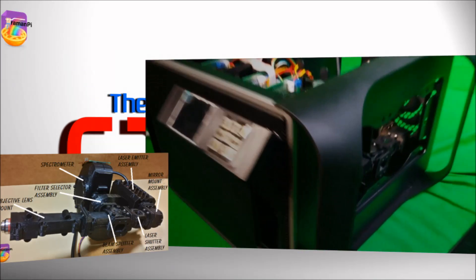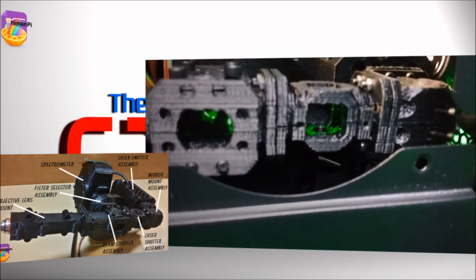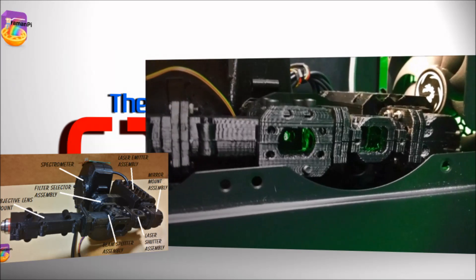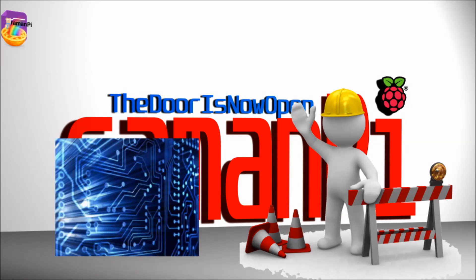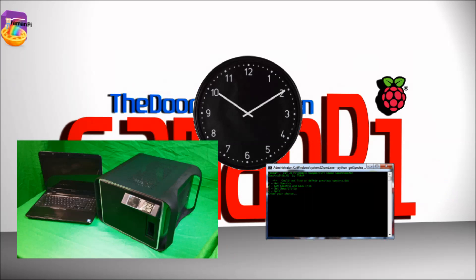The optics section is a great success. All of the plastic parts fit together perfectly — the unit is solid. The laser shines, the beam bounces from the laser and hits the splitter; half the beam goes to the objective lens and the other half goes to the filters. The selector wheel spins and chooses the filter, the beam goes through and into the spectrometer, which images the spectra. It just needs a little alignment and calibration. I focus mainly on design and construction of the electronics and optics — the software that currently exists is mostly for testing, but I will be devoting as much time to software as I have to hardware in the very near future.